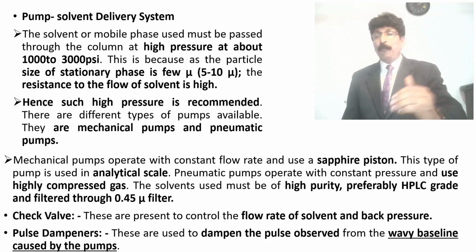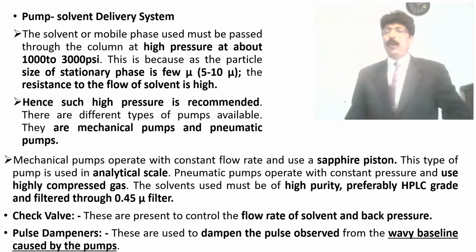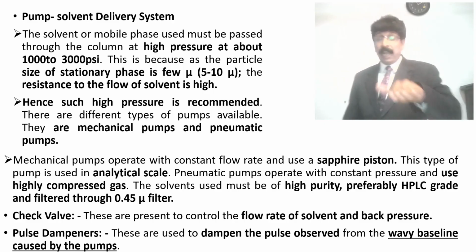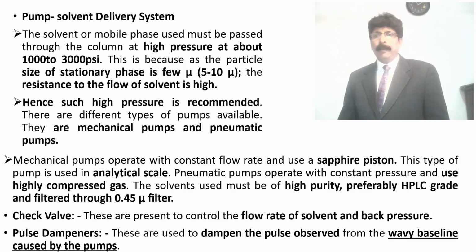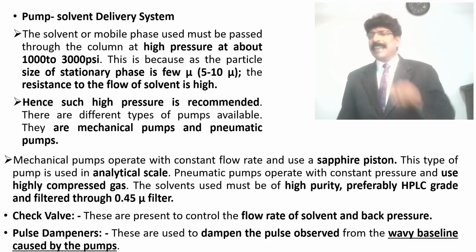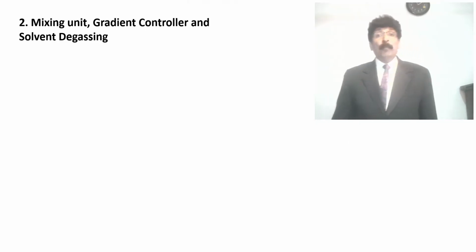A wavy baseline will also affect the integrated area in the computer if the pump is having a pulsative pressure. So these dampeners can be used for reducing this type of wavy baseline in the result. Second one: mixing unit, gradient control and solvent degassing area.